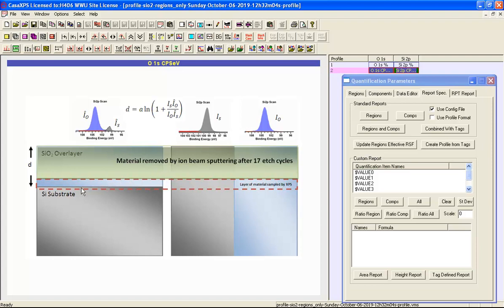Under this circumstance, we would expect to see a peak that represents the oxide peak and some evidence of an elemental peak. The scenario is that we have a small amount of the silicon and a film of oxide that we can measure using the Hill equation, and that gives us an idea of the sputter rate, because the profile will continue and eventually will remove all the oxide, leaving just the elemental silicon. So we should get an idea of how long it takes in seconds to remove the oxide layer of a given thickness, and hence calculate a sputter rate.